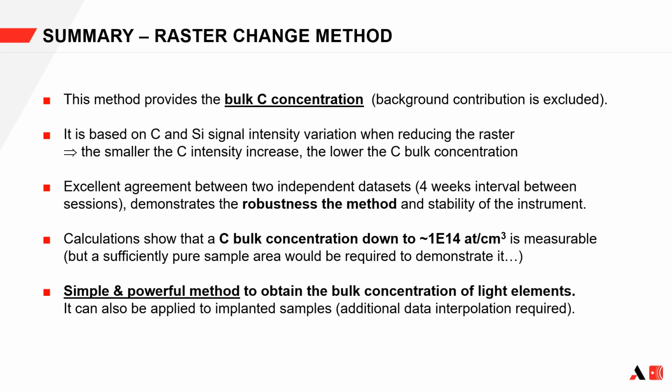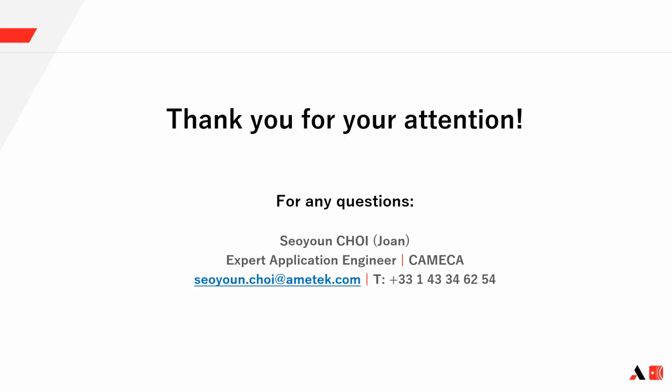As you have seen so far, the bulk concentration of light elements can be measured with a simple and powerful method, and it can also be applied to implanted samples. This is all we prepared about the detection limit optimization of carbon in silicon.